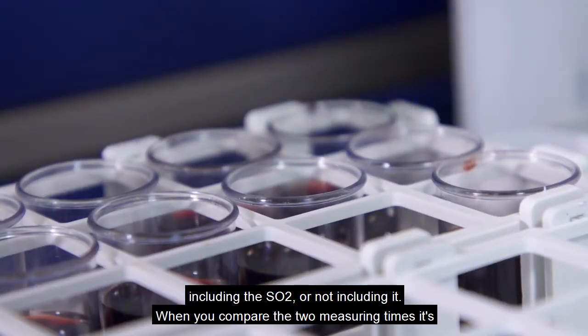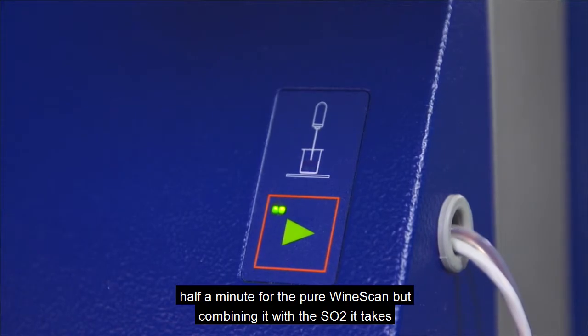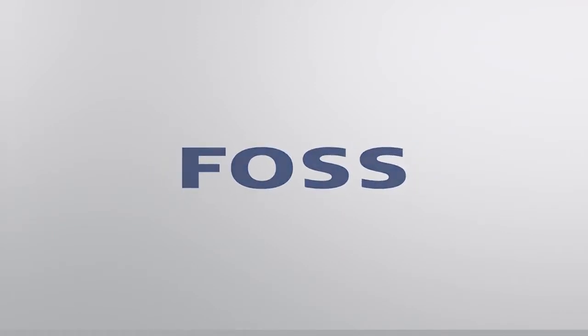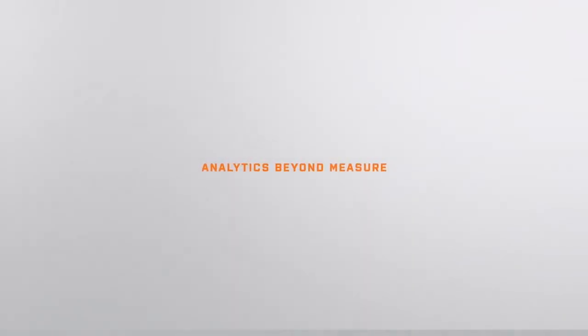When you compare the two measuring times, it's half a minute for the pure Winescan, but combining it with the SO2, it takes two and a half minutes.